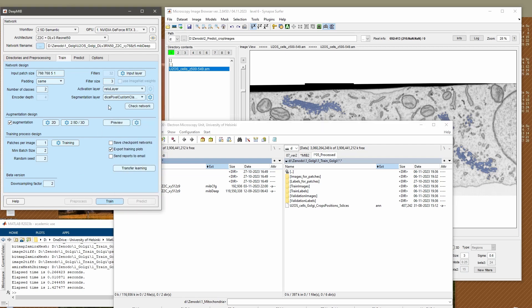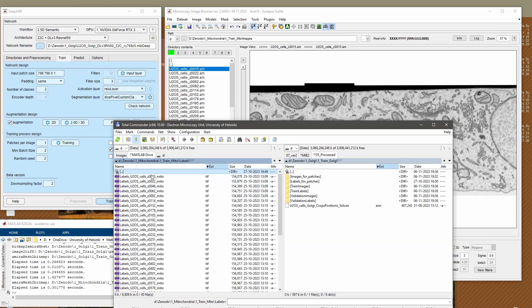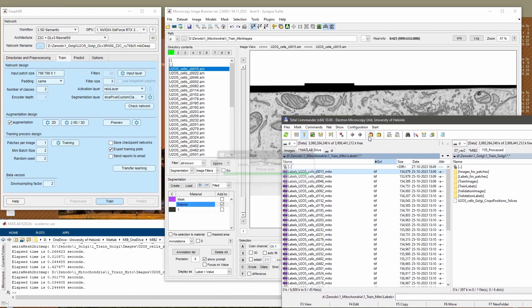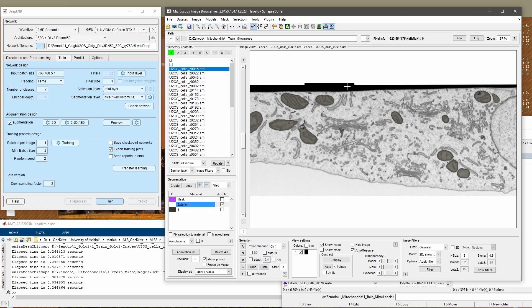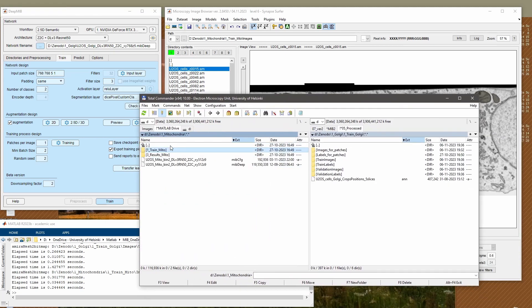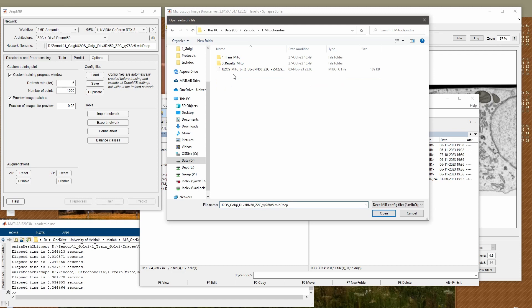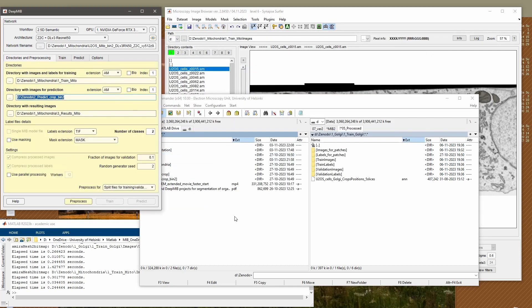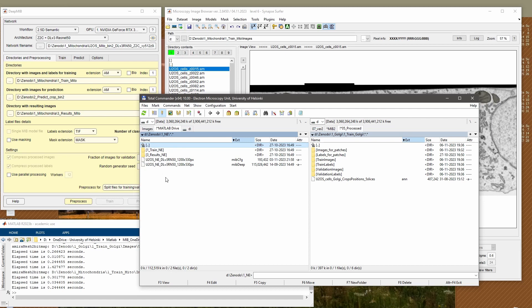The mitochondria network is slightly different. The network for mitochondria was trained on a twice-downsampled dataset. Looking at dataset parameters, you can see that xyz are all five nanometers because the xy dimension was downsampled by a factor of two. The rest is similar to the ER workflow, but the key difference is that the predicted dataset is also the twice-downsampled version — if you want to apply this to the full-resolution dataset, you need to upscale the results afterward.